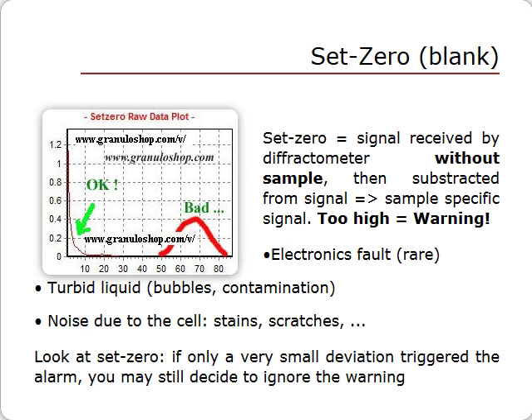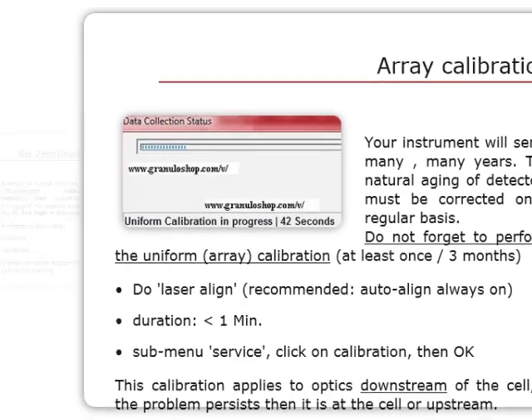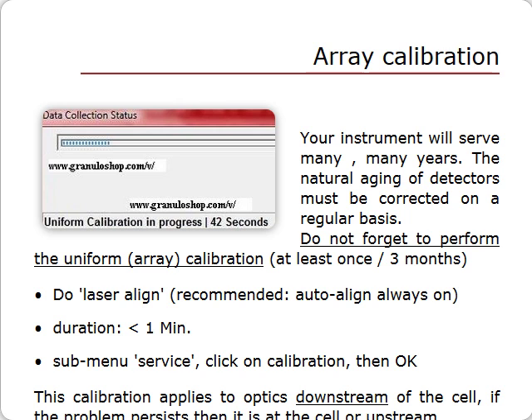If needed, have a look at the set zero. If the warning was triggered by a small margin, you may disregard it. Your particle size analyzer is built to serve you many years and should be adjusted on a regular basis to correct for detector aging. You should perform this array calibration every day, every month, or every three months — sometimes more often.